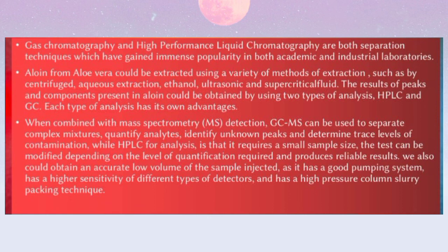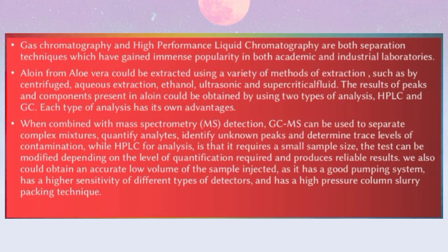The test can be modified depending on the level of quantification. We also could obtain an accurate low volume of the sample injected, as it has a good pumping system and higher sensitivity of different types of detectors.